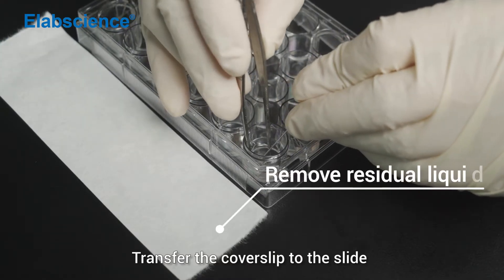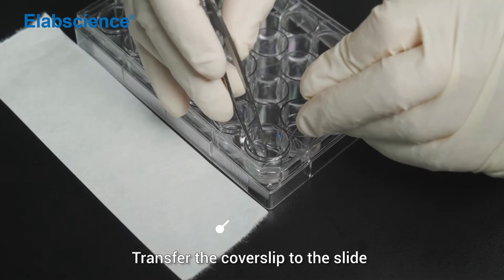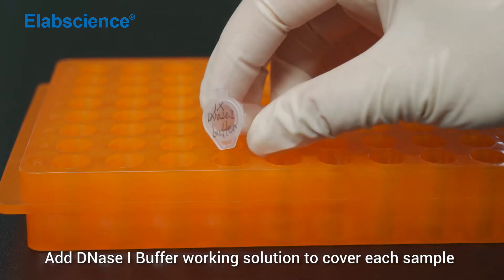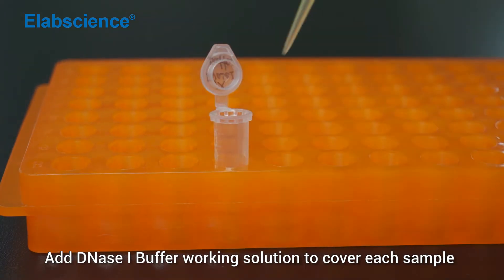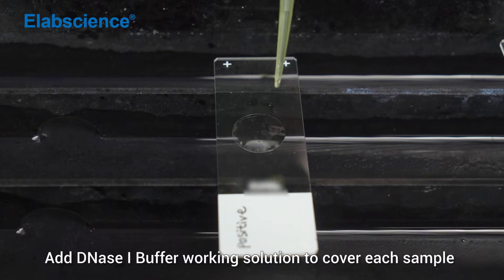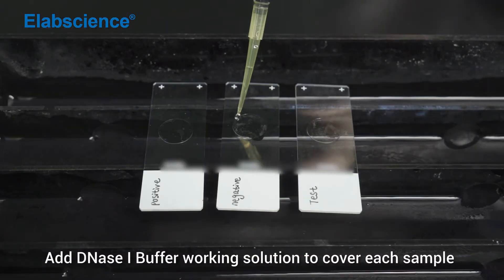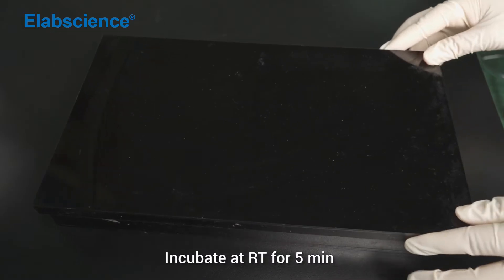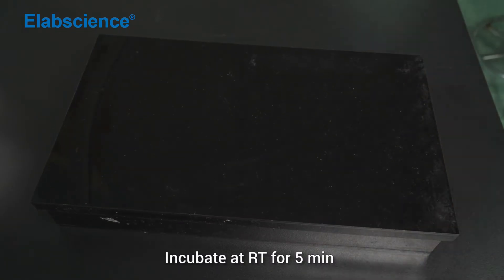Transfer the cover slip to the slide. Add DNase I buffer working solution to cover each sample. Incubate at room temperature for 5 minutes.